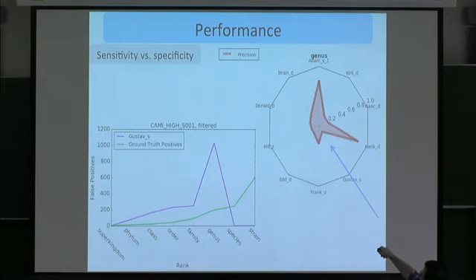This right here is ground truth positives, and this is a plot of the false positives. There were only 200 different genera in the high sample, and Gustav predicted about 1,100 at just the genus level. So this little dip right here can translate to a large difference in false positives. So just be aware of those kinds of things.